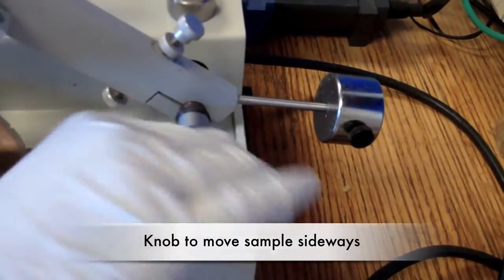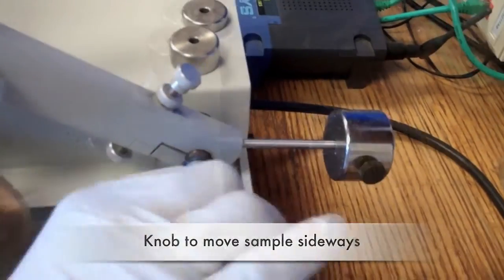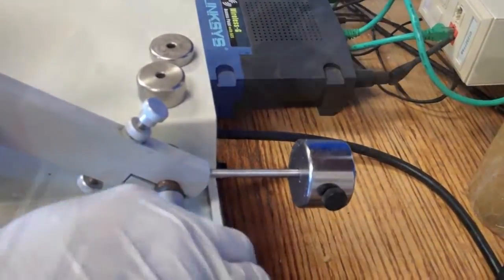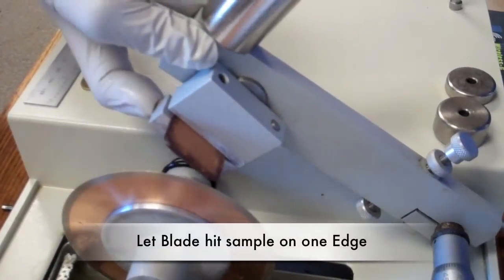The sample can be translated using the knob at the back of the machine. Each rotation is about one third of a millimeter or three turns will result in approximately a one millimeter translation. Once you reach the location of your first cut, you can set the material onto the blade.